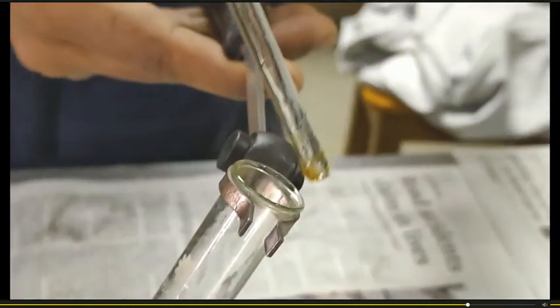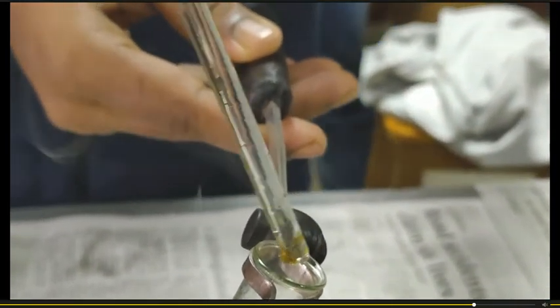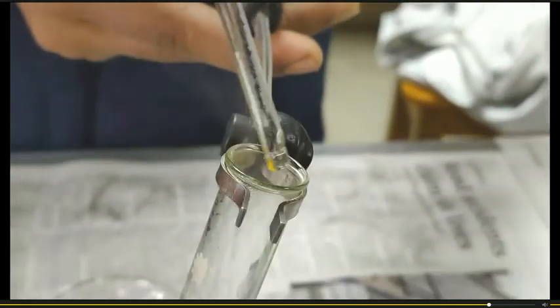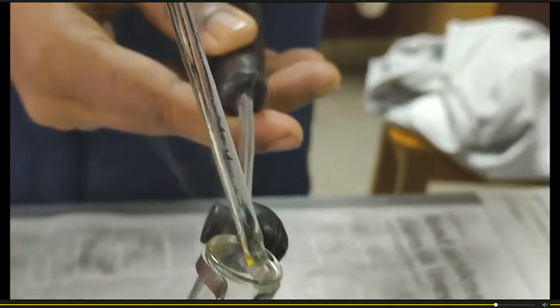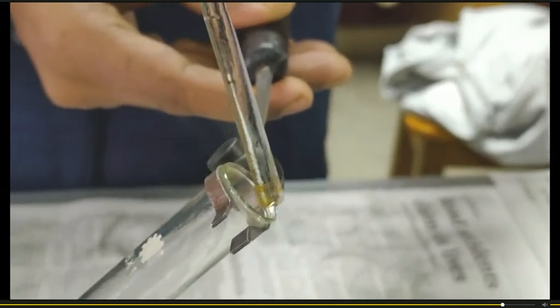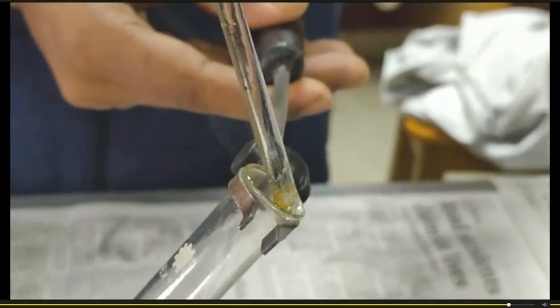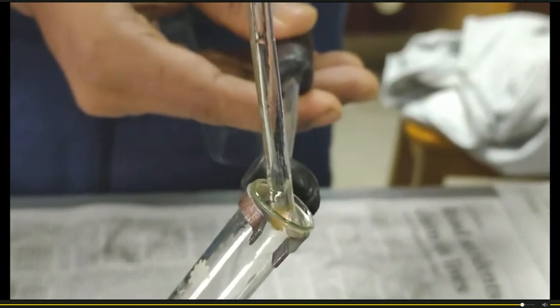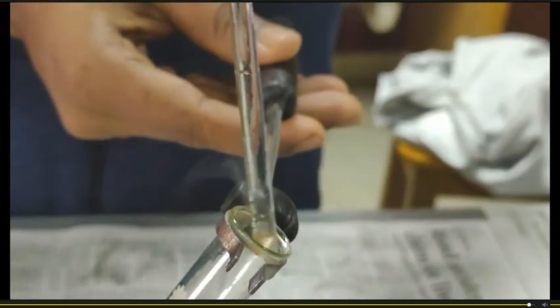And whenever a hydrochloric acid dipped glass rod is placed at the mouth of the test tube, it produces white fume. This is all about ammonium. This white fume indicates the presence of ammonium. This is the white fume of ammonium chloride.